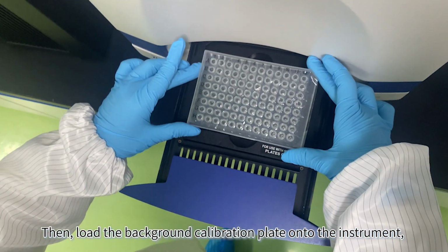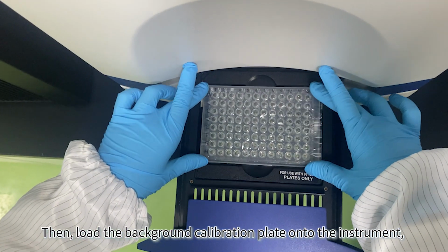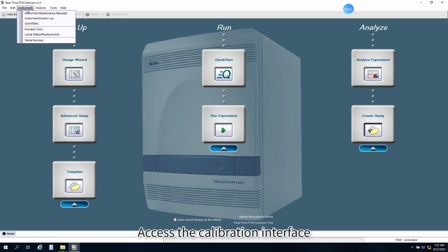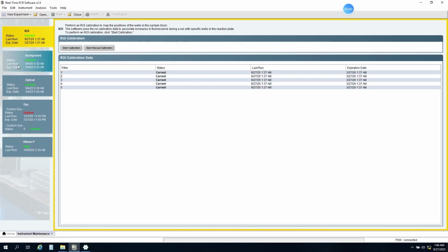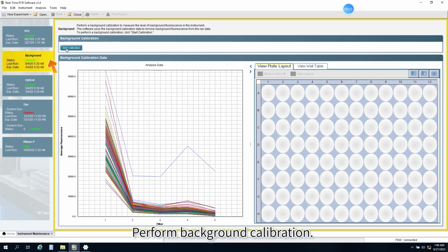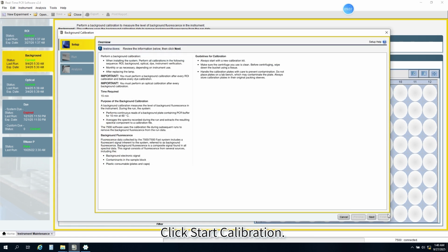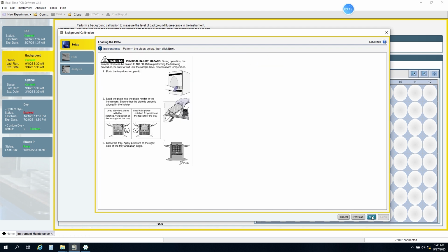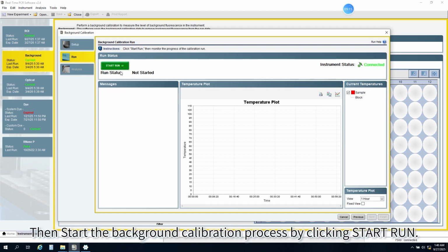Then, load the background calibration plate onto the instrument, aligning well A12 in the upper right corner. Access the calibration interface from Instrument Maintenance Manager. Perform background calibration. Click Start Calibration. Click Next 4 times to confirm the calibration instructions. Then start the background calibration process by clicking Start Run.